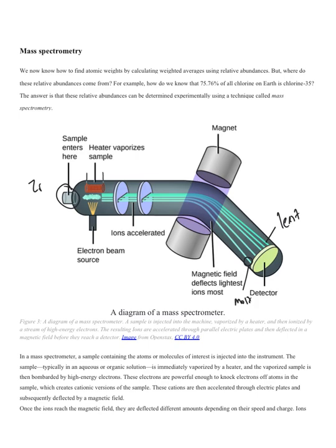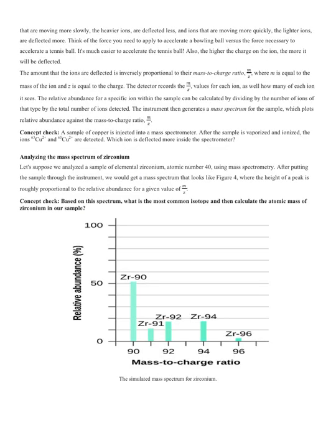The isotope that is deflected the most has to be the lightest because it'll be the easiest to change its path. Those that are heavier will not deflect as much because of their inertia. With more mass, it has more inertia. It's a physics concept, and therefore we're able to separate the individual isotopes based on their relative size because of how much they deflect. The analyzer then determines how many of each is present throughout the sample, and from that we can gather the following data, which we can see right here.